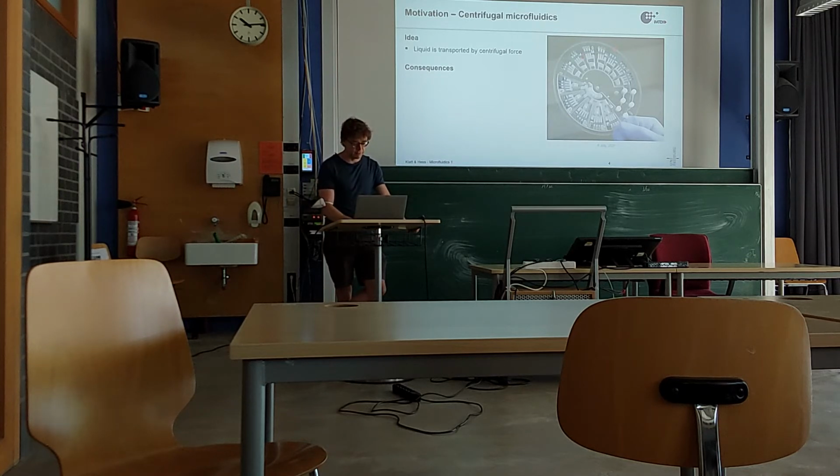And the fluidics are those chambers depicted here on the cartridge. The main idea of centrifugal microfluidics is that you use the centrifugal force field to transfer liquids or to transport liquids along these structures.